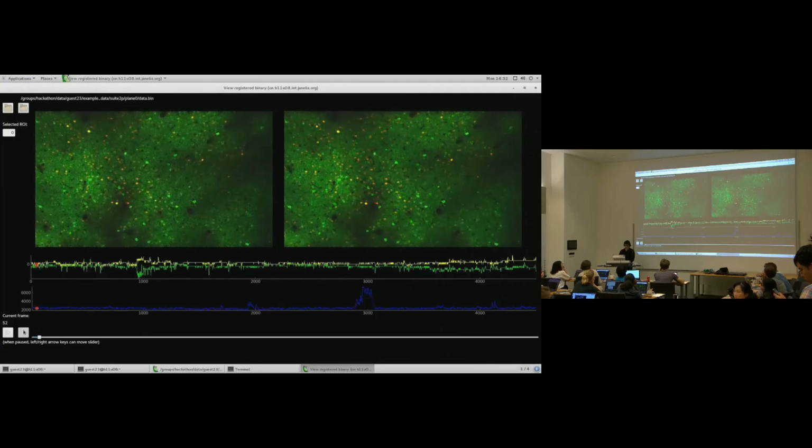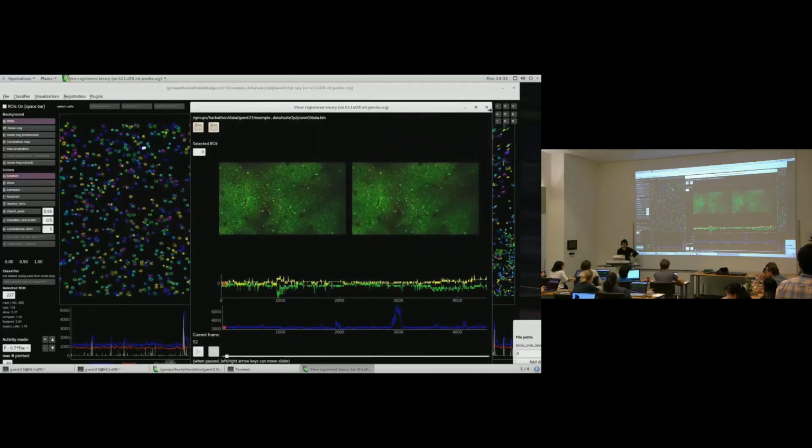If you didn't finish processing, you can just load from Carson's folder the results. Everyone has access. All right. So do you see this thing here? I'll show you how to load it. Actually, I'll just do it again because it won't take too long.